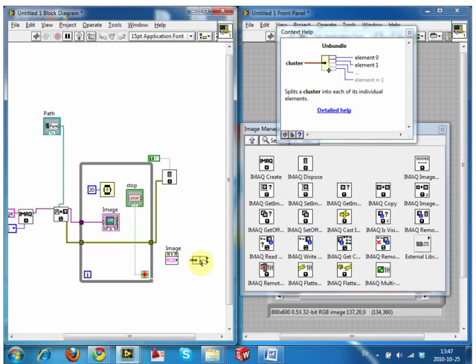All the time when I right click, something different appears, like functions or something like this. That's why I'm lost. No, it's fine. So what do you see when you right click? You don't get this?